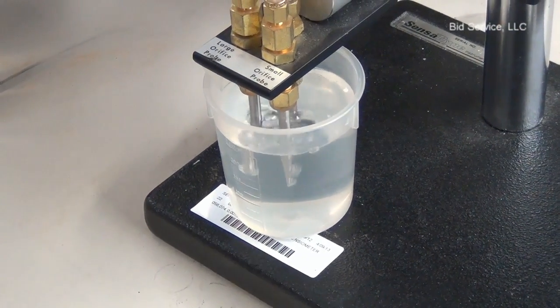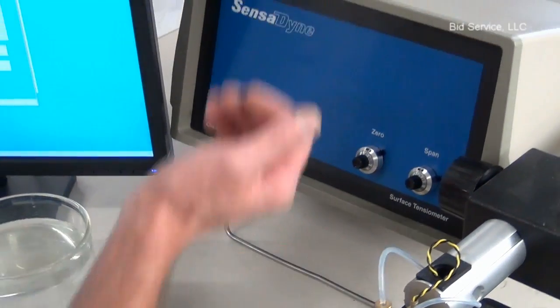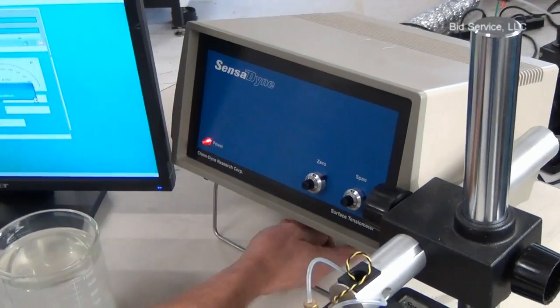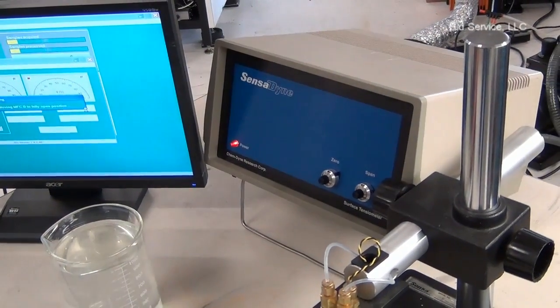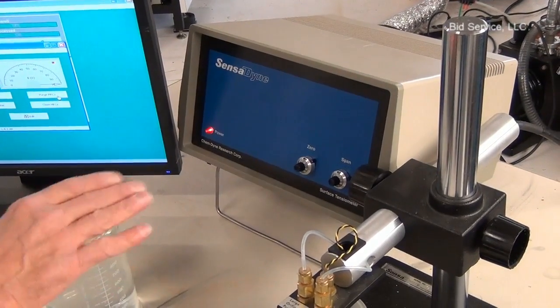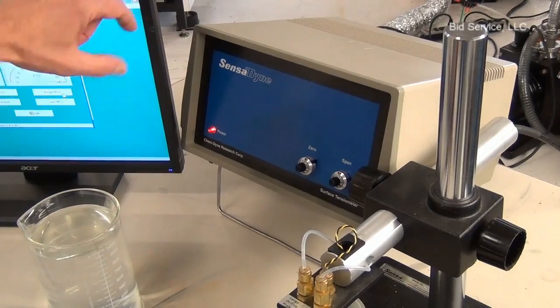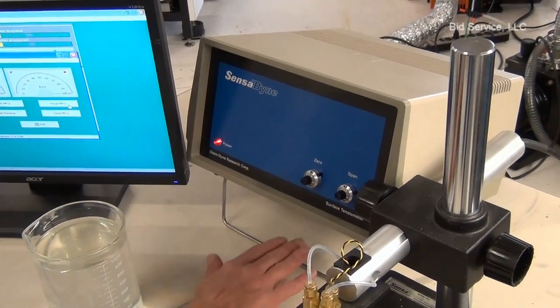One thing to note is that this should be lifted up like this so that you get airflow through the box. There's a vent in the bottom and the top, and it's just convection flow through the box to cool the electronics. Very important — otherwise you get shifting of your readings because of the heat built up inside the box, so it's very important to have this lifted.